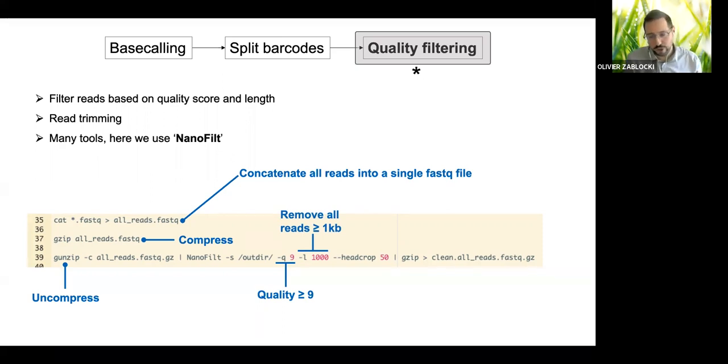This is to ensure that we don't keep noise, these pieces of DNA that may have broken up and are not really supposed to be there. After all, this is a long read run. So most often you have reads from a couple of base pairs to maybe a couple of hundred that are really just noise and garbage that you should discard.